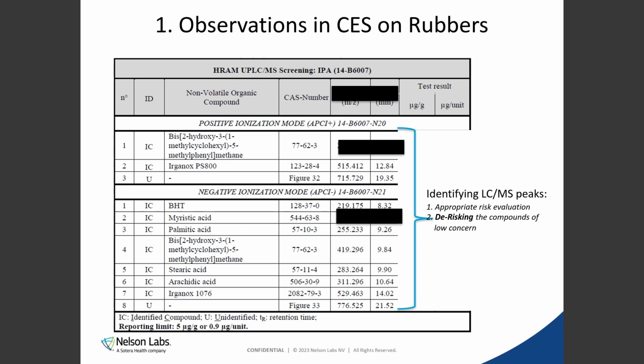Only if there are some unknowns, even at a small concentration, your toxicologist will tell you that is still a big issue, because it can be a compound with high toxicity and should be handled as a compound with the highest level of concern, meaning the lowest allowed concentration in your extraction.